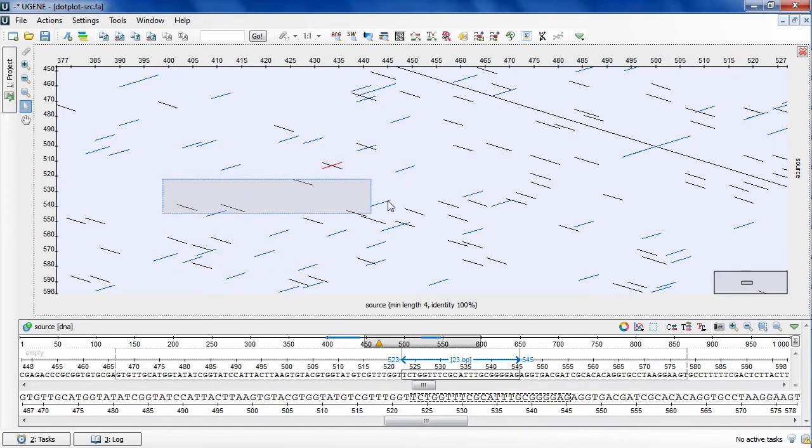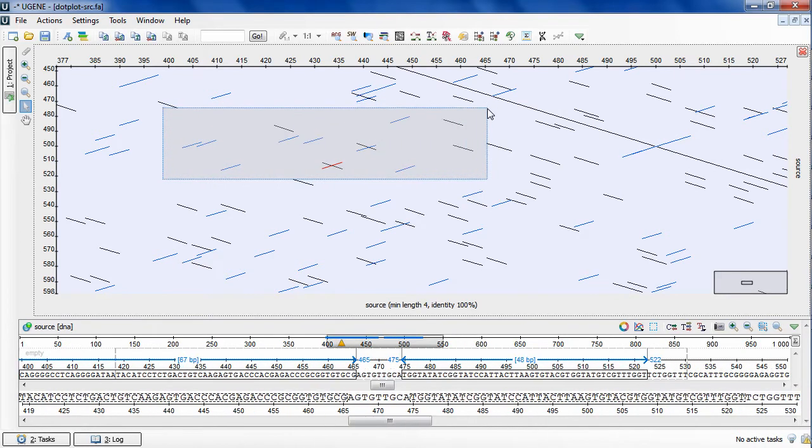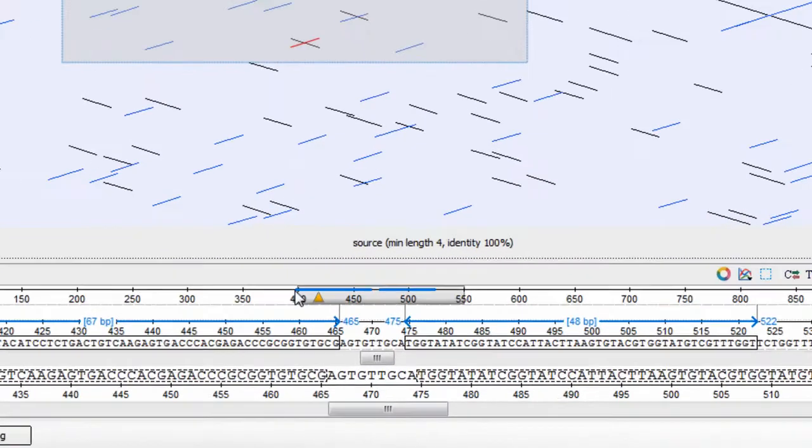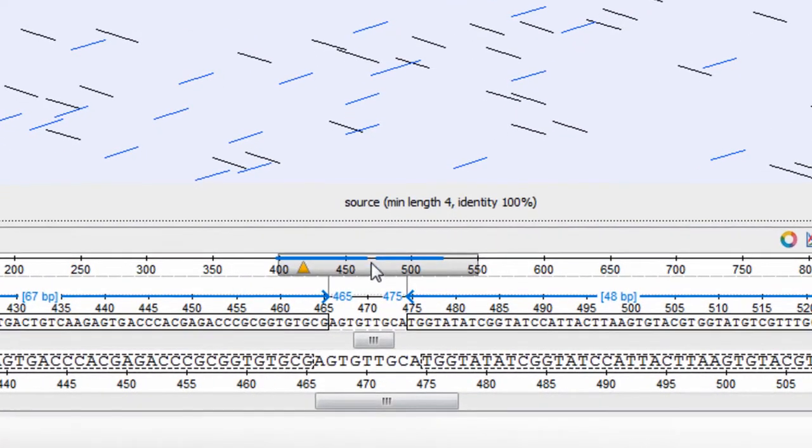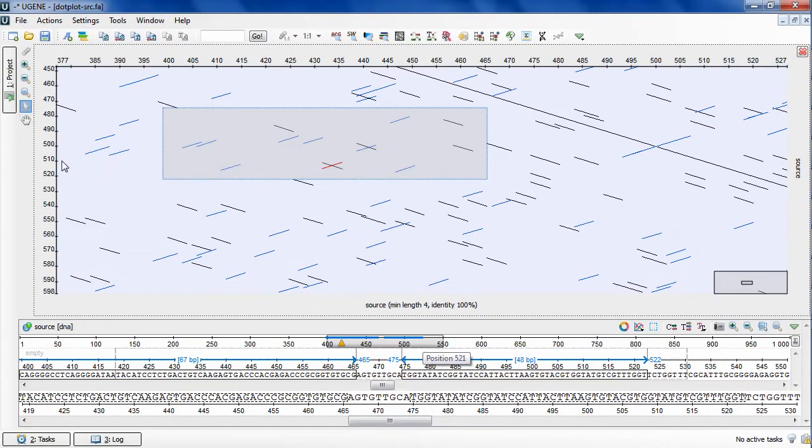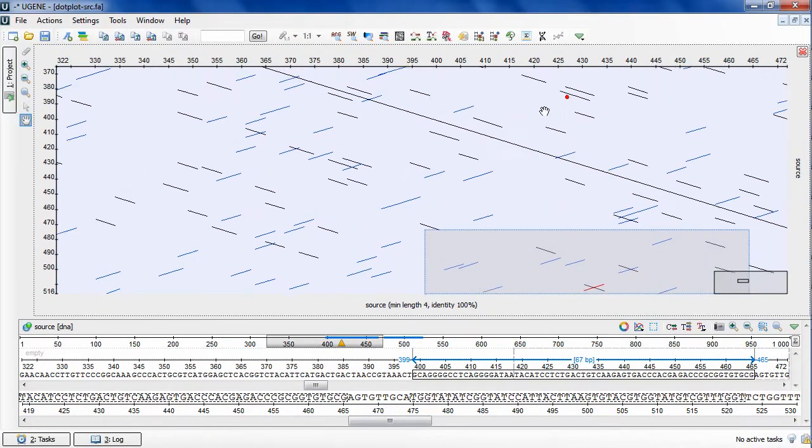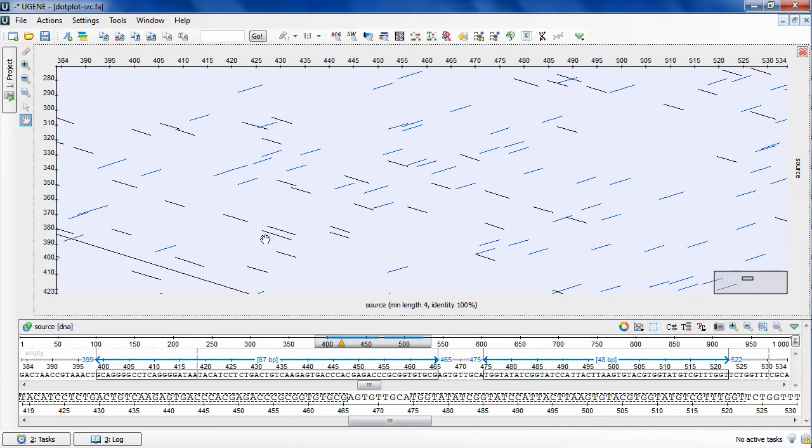In case of comparing sequence to itself, two selections will appear on one sequence view. And the new hand tool allows you to move the zoomed plot by dragging the mouse cursor.